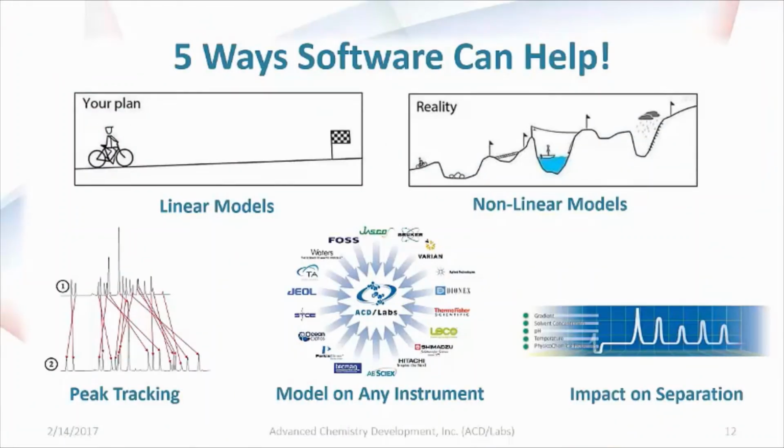So the goal of this was to introduce the ideas to everybody on the different ways software can help, and we had shown how you can go through and create a model of your method that you're hoping to develop, as well as how you can tweak your separation parameters using our simulation tools.